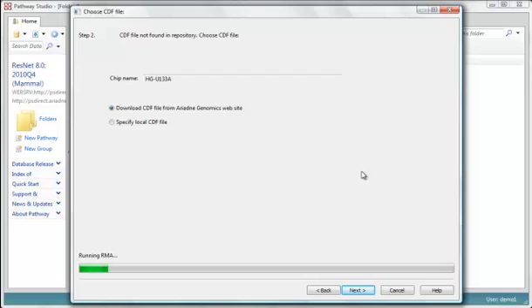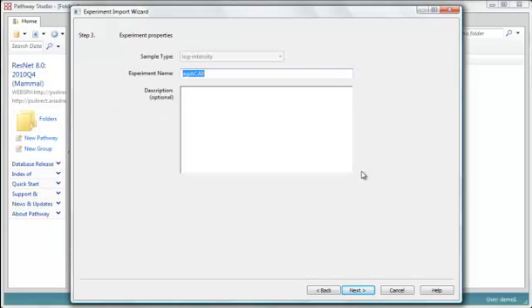So now it's running the RMA, that's Robust Multi-Chip Analysis. This considers all of the chips and looks for variations between them, and it's a normalization. Now it's done.